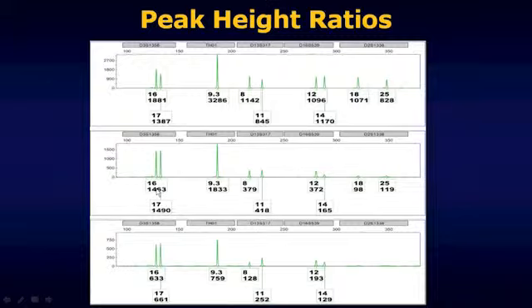And in this individual's DNA, for every time there was a copy of the 16 allele, a chromosome that had the 16 at the D3 locus, there was also a chromosome that had a copy of the 17 allele at the D3 locus. And so at the start, there were equivalent amounts of 16 and 17 in whatever material was collected from the individual who gave rise to this reference sample. Right? They started out with equal amounts.